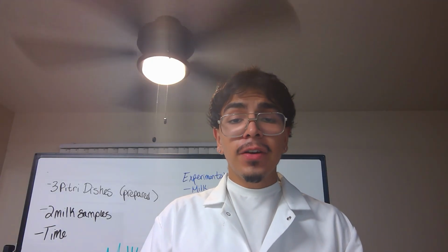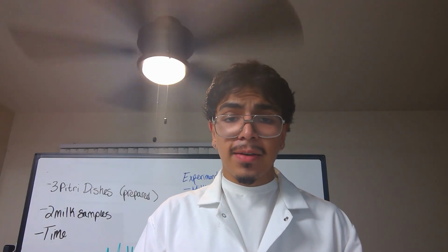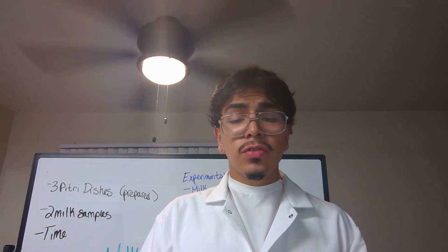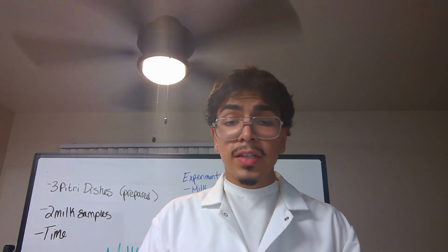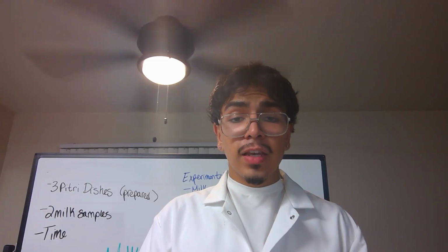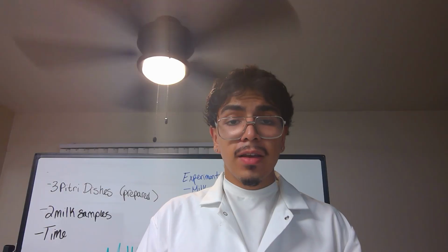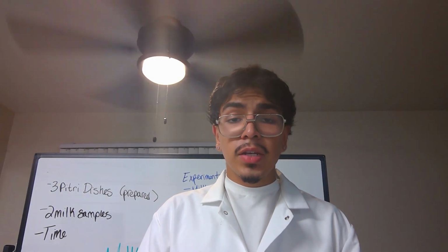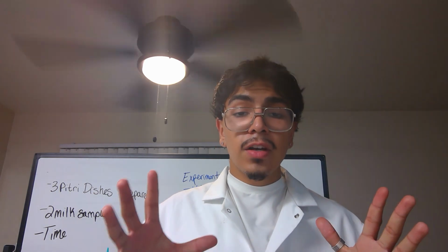Labs are very interesting and they can be fun, but it's important that you exercise the proper and very much needed amount of caution when handling anything. Not only to ensure that your lab goes well and you can produce a high percent yield, but also to ensure your own safety. Because as often as we think of school as a safe environment and of labs as being in our control, things can quickly run away. So it's important to always know where your hands are and to always know what is going on in front of you and around you.